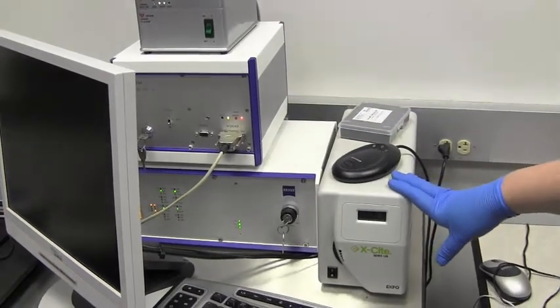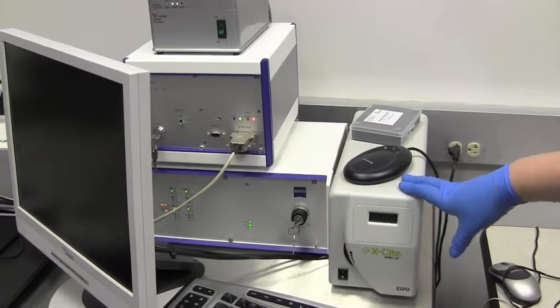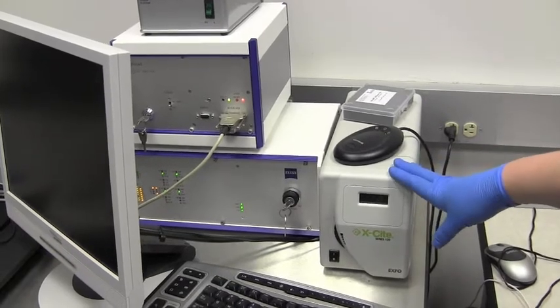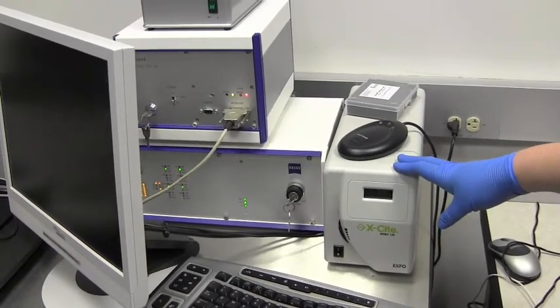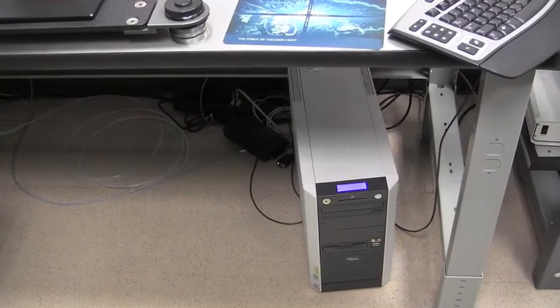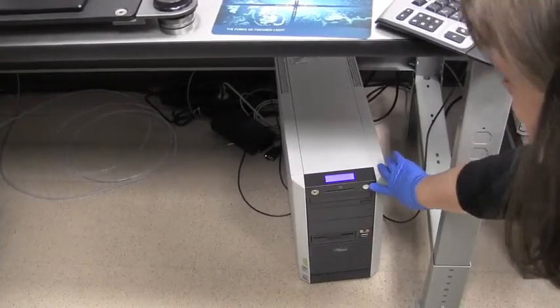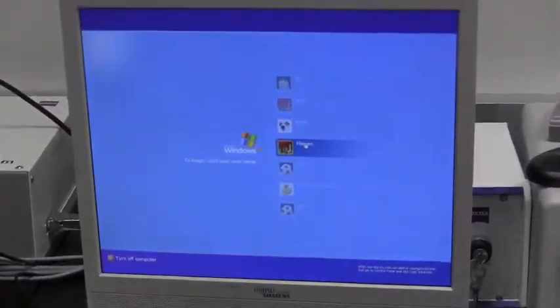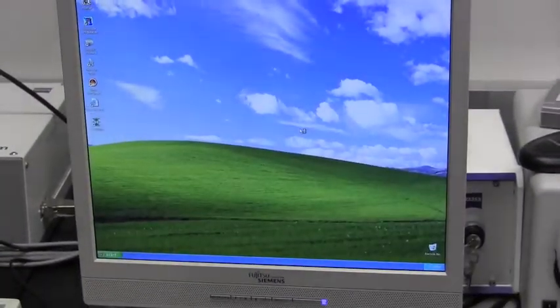Now this box here is for fluorescent microscopy. If one of your fluorophores that you're looking to cut out of the cells lights up, you would turn this excite light on. Down below the microscope, you're going to want to turn on the computer. And when that's started, you can log in using your special personal login.